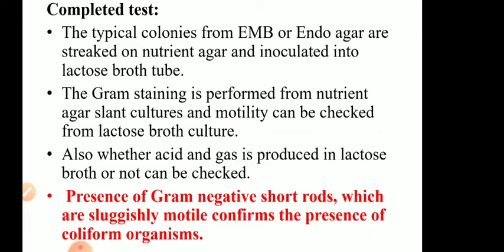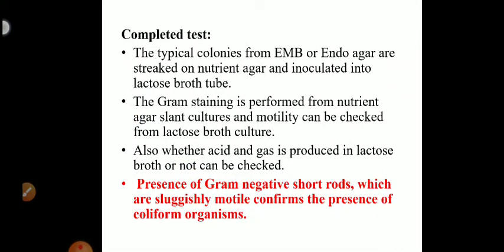It is one of the bacteriological analyses done for testing. It is one of the tests used in bacteriological analysis of water. The others are the membrane filter technique for coliforms, MTDT for fecal streptococci, and MFT for fecal streptococci, which we will be studying in the coming lectures. That is all for today.